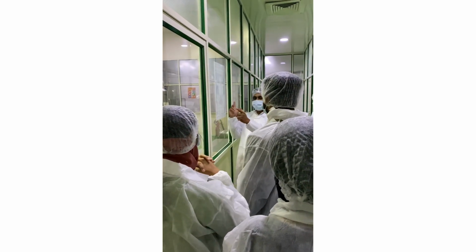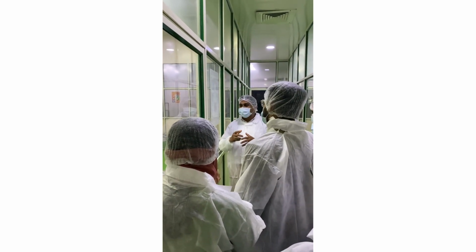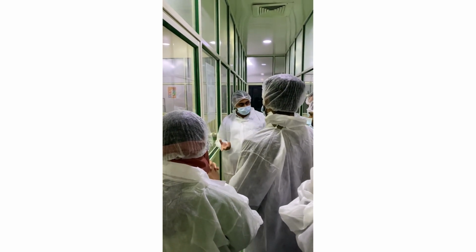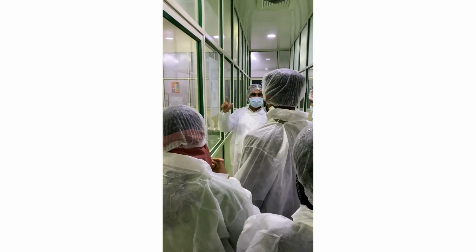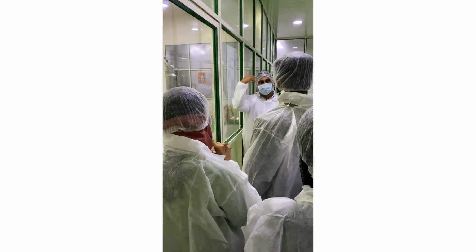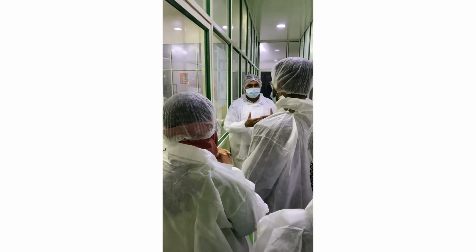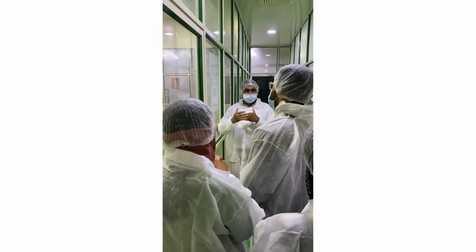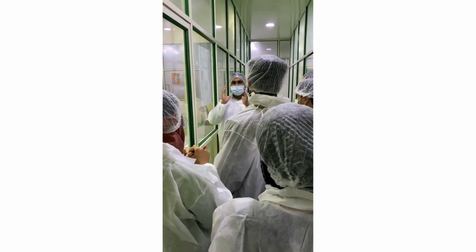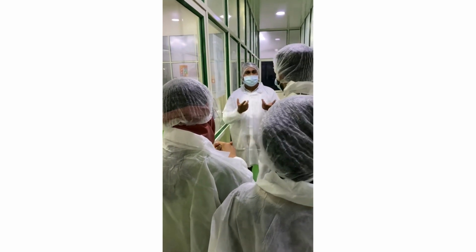Then here we do formulation and batch manufacturing. The production department does documentation, and after that they do batch manufacturing. Then it is sent to the stores, the godown. Then it goes to sales. These are a series of steps, so that we ensure the food we are consuming is safe. How will food be safe?